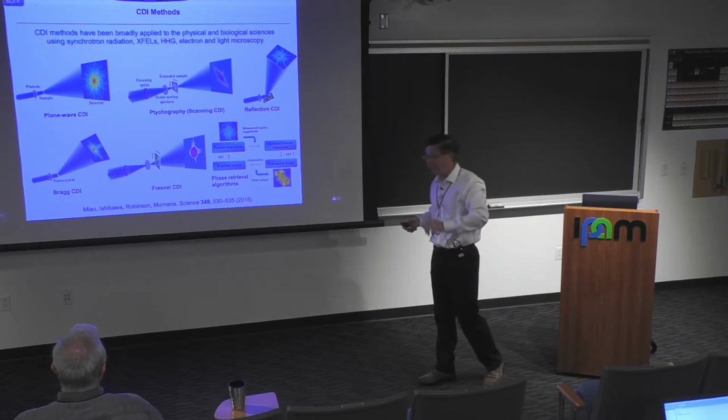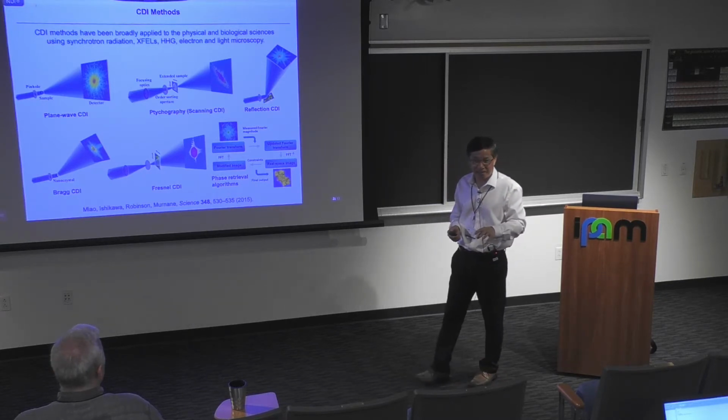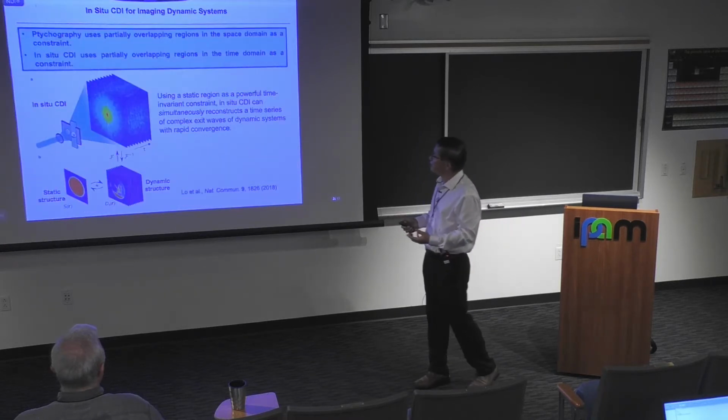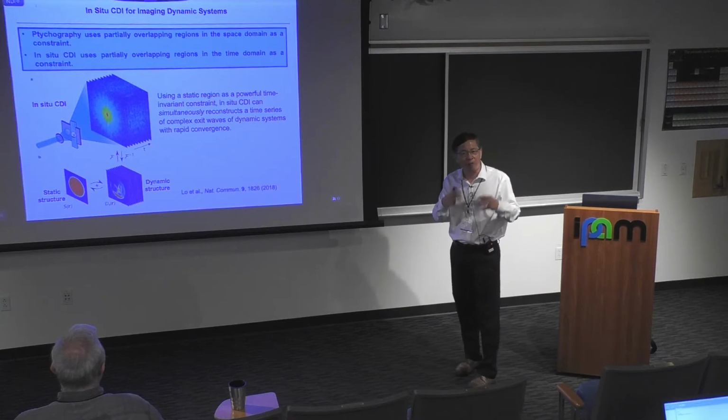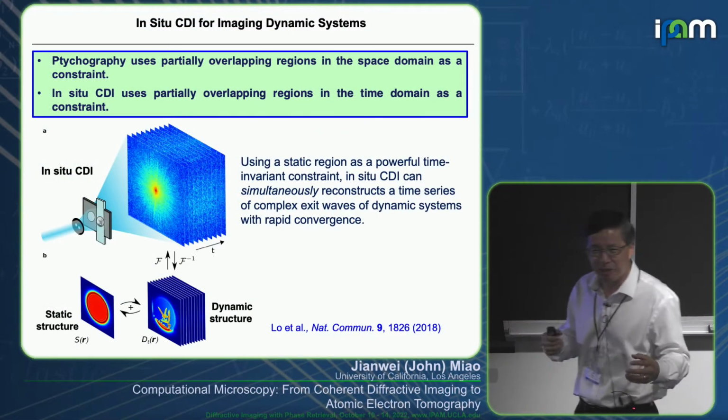I just went to a Caltech workshop. Fourier ptychography in light microscopy has become a bigger deal in that field. And also electron ptychography has become big, right? So this is dramatic. So in the following, I'm going to show some of our recent results, actually some from 2018. So relatively new results, okay.